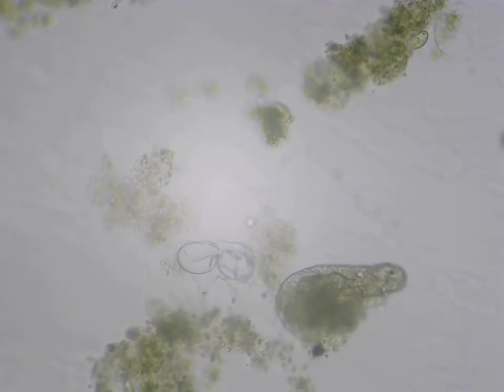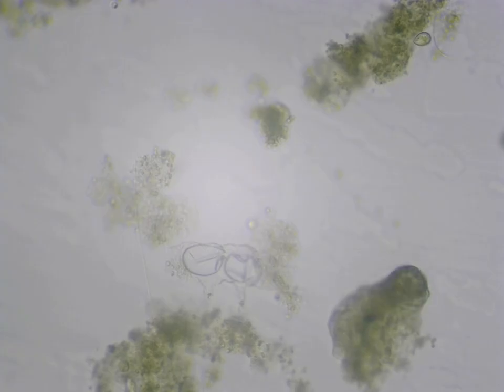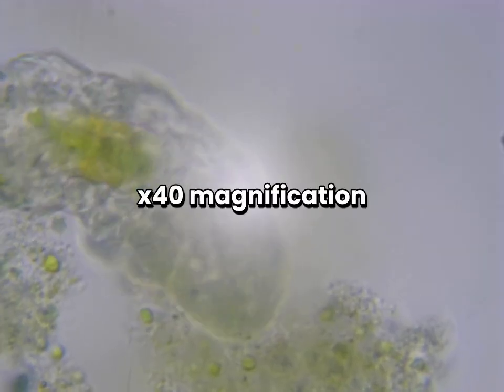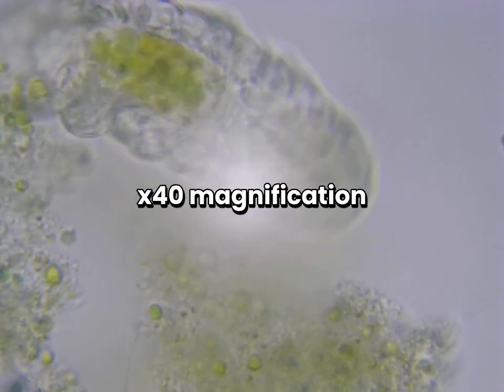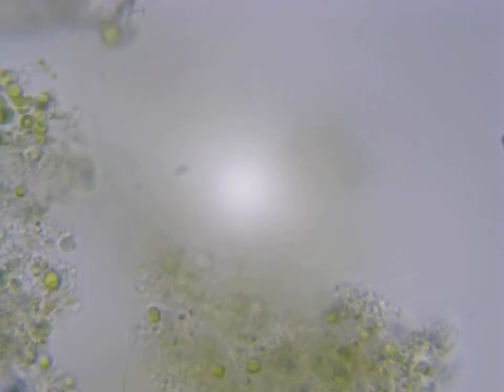Despite their tiny size, tardigrades have a complex anatomy. They have a head with a mouth that has stylets for piercing plant or animal cells. They are often herbivores or feed on other small organisms.